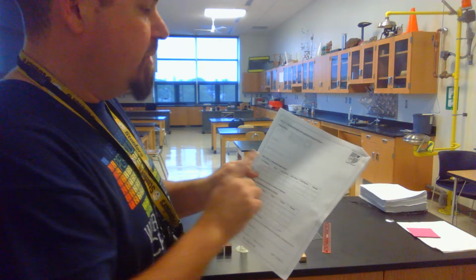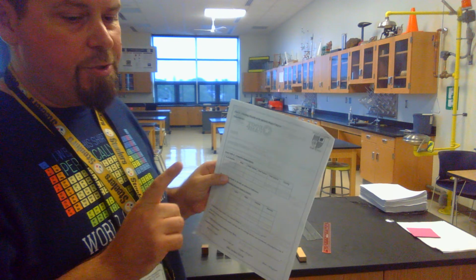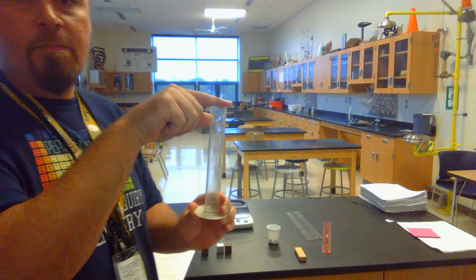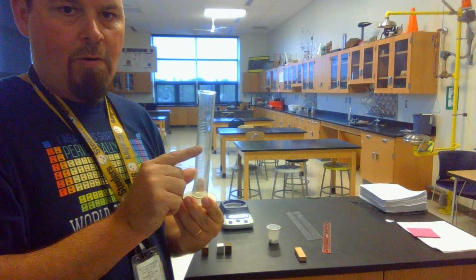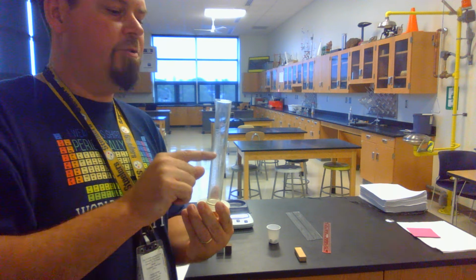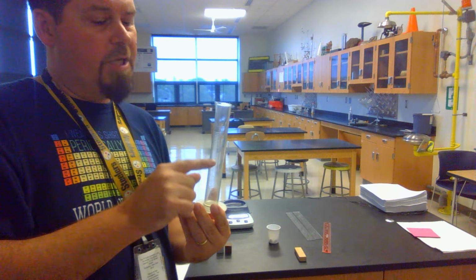I want you to do 2 trials. I want you to do different numbers of marbles. And I don't want you to do ever just one. Okay? And here's why. We're going to use graduated cylinder to figure out the volume of our marbles by displacement. If I put in 1 marble, I'm not going to change the volume of the water very much. And it's going to be hard to get an accurate volume measurement.